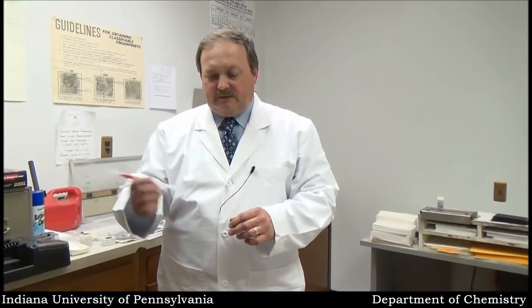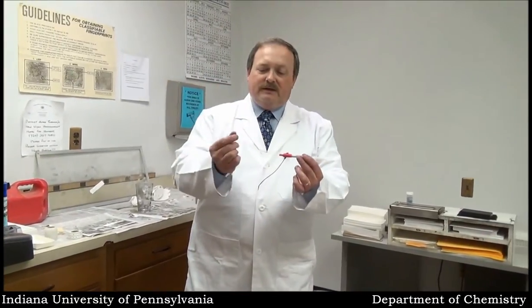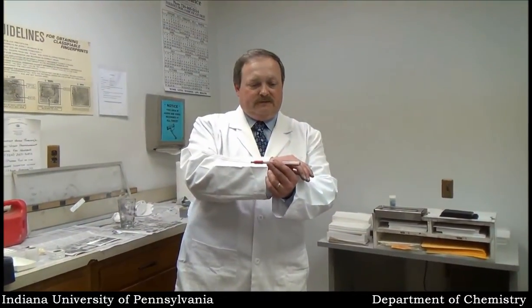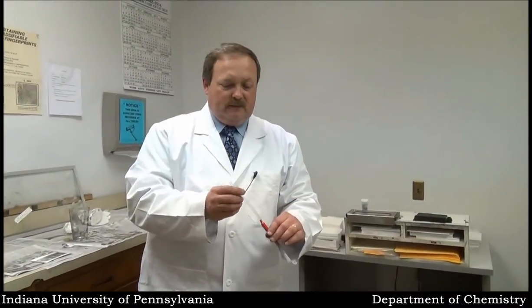I'm basically going to break these ampules, mix these products together, and then — I always run out of air when I do this — I'm going to give it a shot. I'm going to blow air into this tube and it's going to put iodine fuming out the end of the tube onto the paper, and we should start to see prints develop.